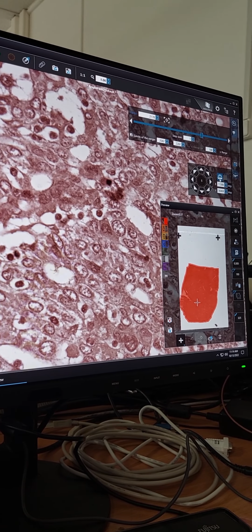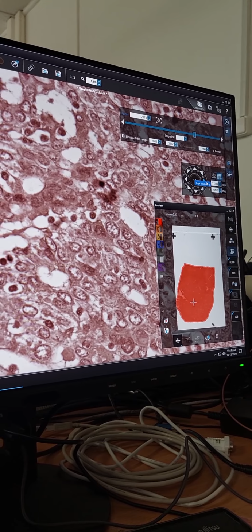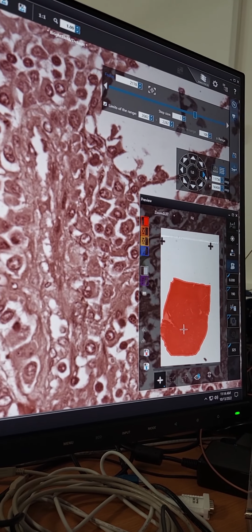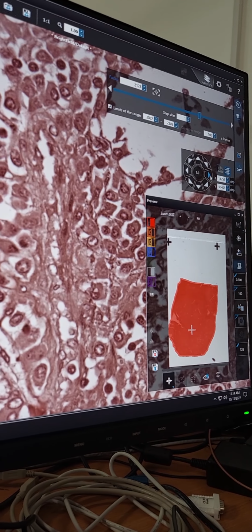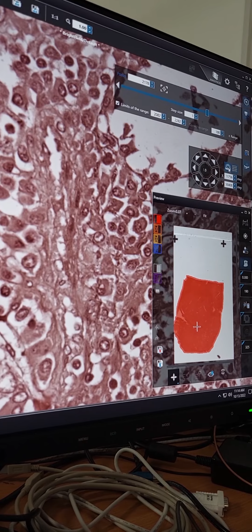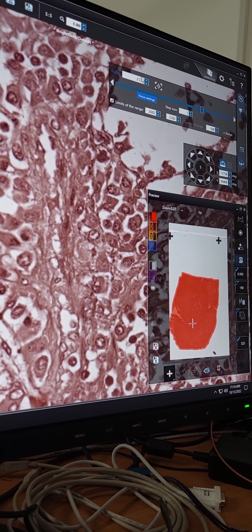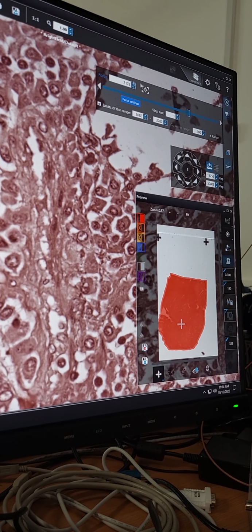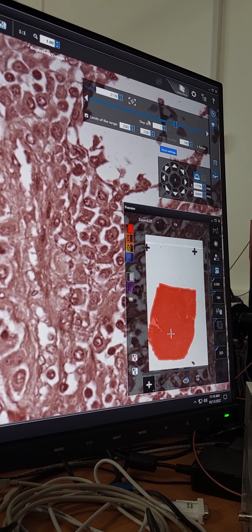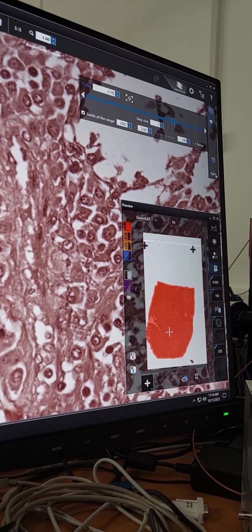You can also use motor step, or you can use fields of view. So I can move one field of view. This is actually helpful, really. It depends on the user which one they prefer, but basically it's the same. So in case of the Z and the XY, you see the motor steps, and you can move with the arrows, and that's it.